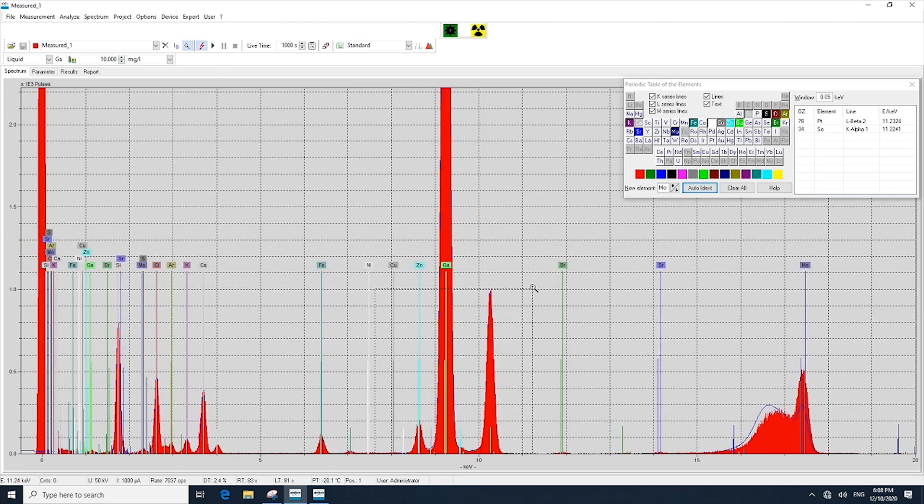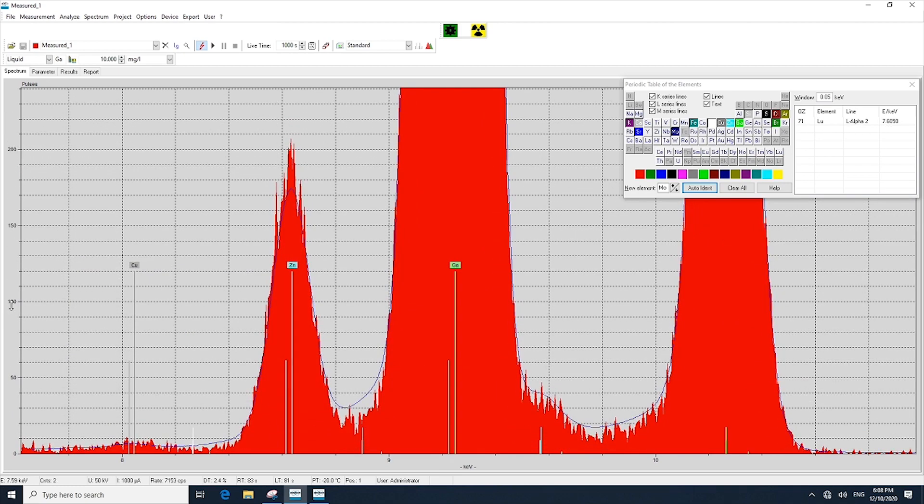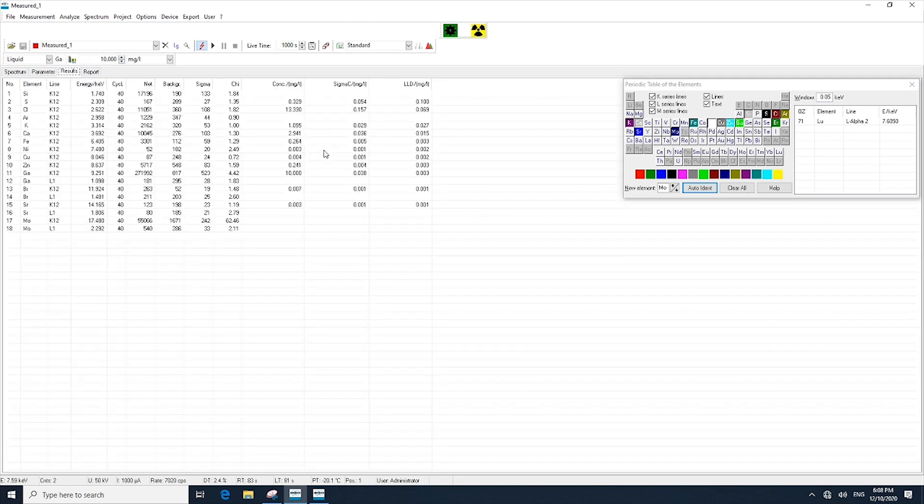After this analysis, we can see how well the actual fit is for the sample. Here we have the spectral fit showing those different peaks and how well we're fitting them. Clicking over to the results section, we can see the concentration for each one of our elements analyzed, along with other information such as the lower limit of detection shown on the far right.